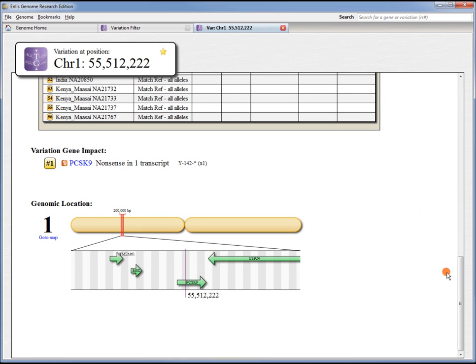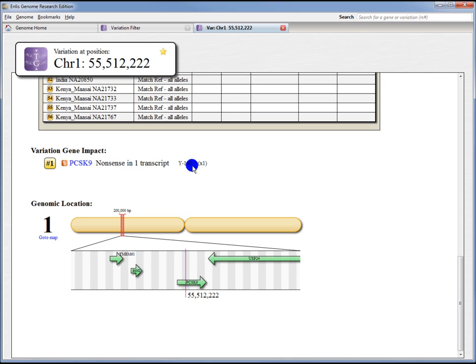Back on the position page, we get more details here. We see it's a nonsense in this gene, one transcript of this gene. We see it's a tyrosine at amino acid position 142 that has changed to a stop codon.